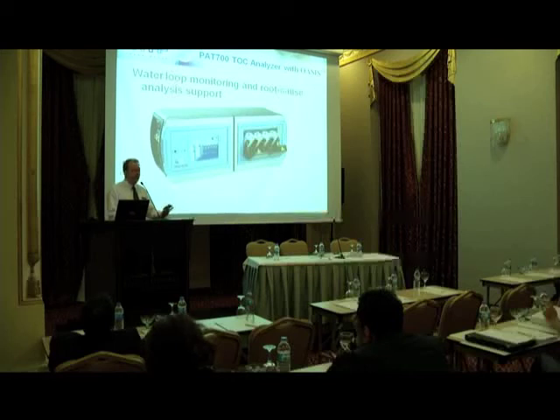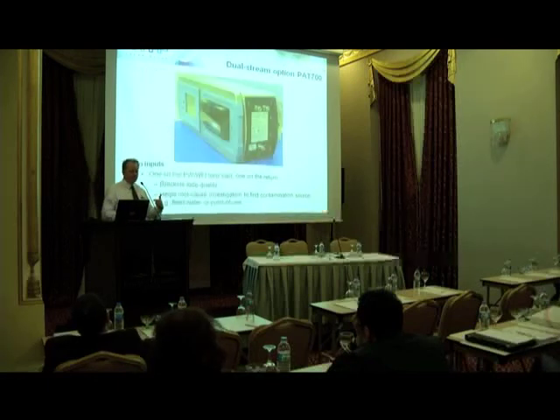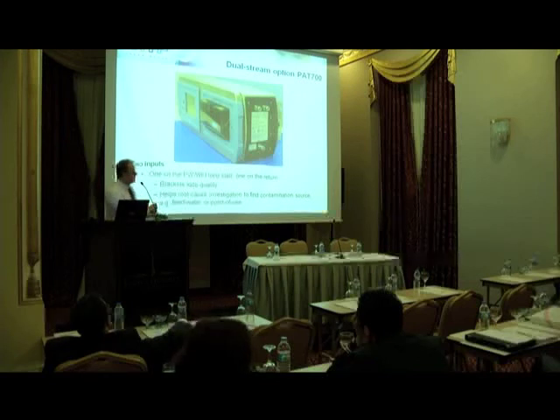So the other bit of root cause analysis we can do with this analyzer, and that one on the table over there will do this for you, is so some of these models can be bought with 2 sample points. So here, if you look at the one that's on the table over there, you'll see there are 2 sample points on there. So what we're asked to do is to demonstrate that the water quality we're using is within compliance, and the sample must reflect the quality of the water we're using.